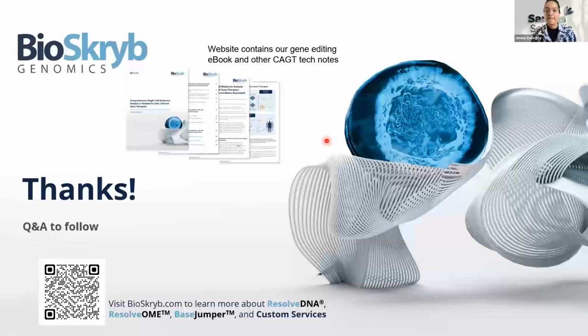Gotcha. So we're talking a lot about single cell. Do you recommend the approach you presented, combining single cell and bulk sequencing, to verify single cell derived CRISPR edited populations? Or would standard bulk be enough, considering the monoclonality of the single cell derived clone?